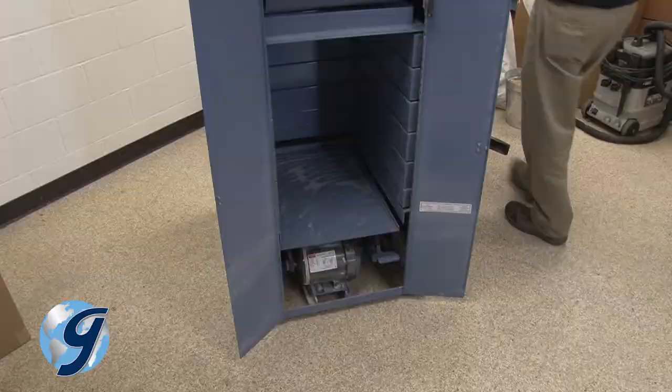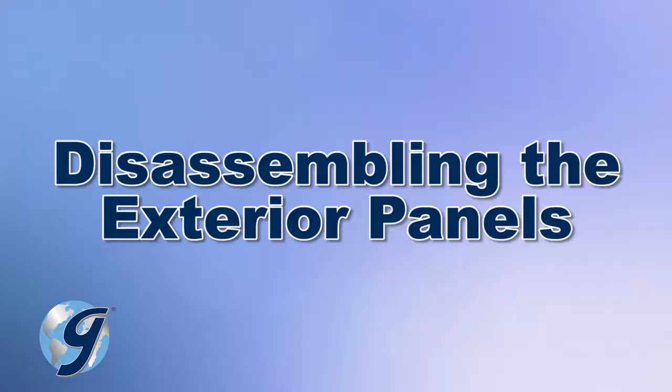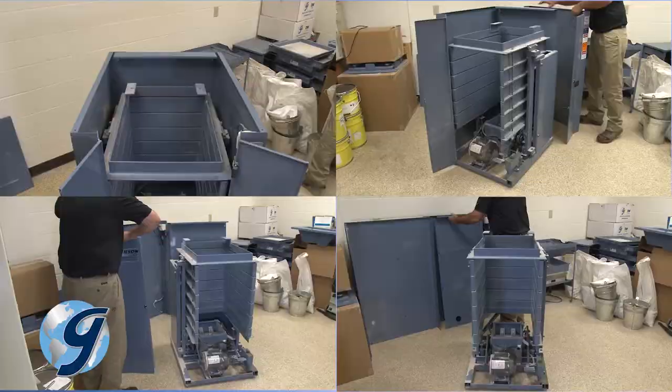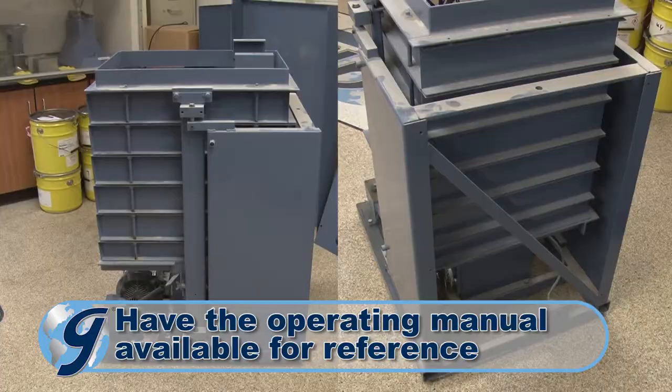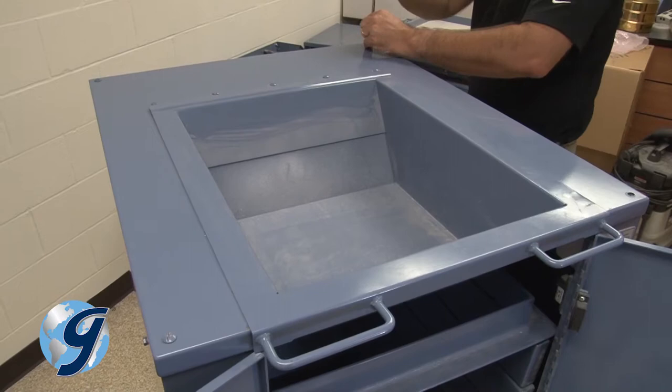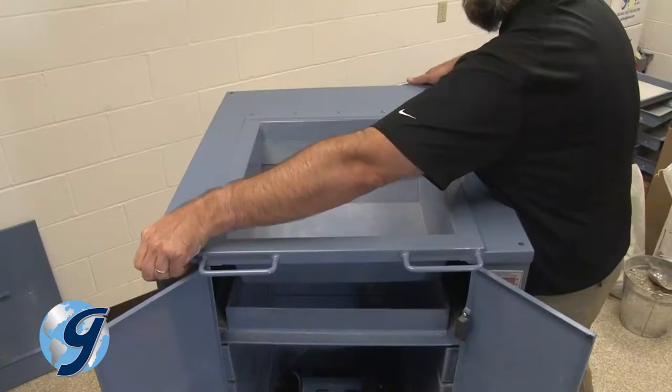Now we are ready to remove the top panel, the right panel, the left panel, and the rear panel in that order. Removing all the panels of the TestMaster may not be necessary to gain access to the timing belt, but for this demonstration all panels will be removed. To remove the top panel with the hopper assembly attached, remove the four screws at the corner of the top panel, lift the top panel and hopper off the unit, and carefully set aside.